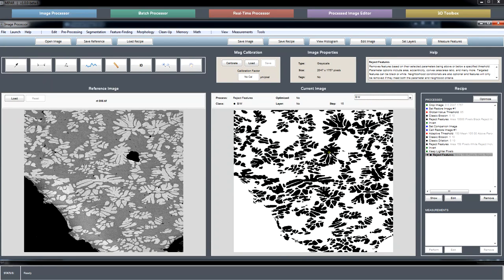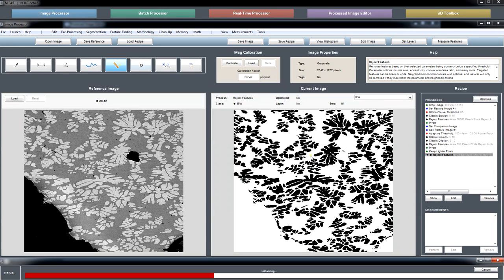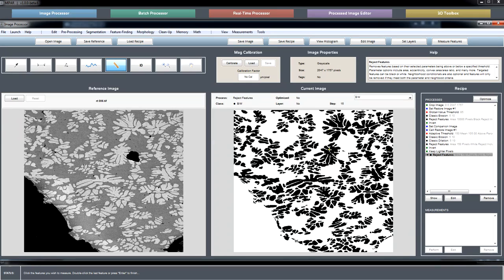And there are features. Now if you want to take the measurement of a couple of features that I know Romulo and some other folks are doing, you can just use this interactive measure tool. Depending on the number of features in your image, there can be a little bit of initialization overhead, but like I think I mentioned in one of the earlier tutorials, we're really working on speeding up that tool and hope to have that out soon. But if you picked a couple of features that you wanted to measure for whatever reason, click on them and hit enter.